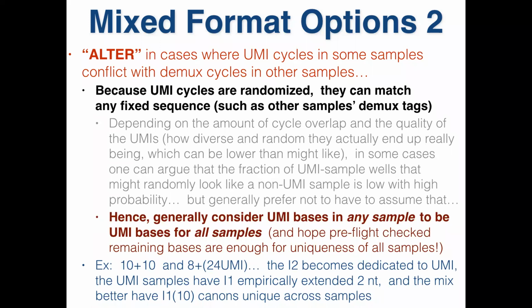And that's what I would recommend. So we upgraded this to 10 plus 24 UMI. This is 10 plus 10. This 24 UMI cycle completely kills this guy. So basically, this becomes a 10 plus 0, or a 10 plus 24 UMI. And this guy's a 10 plus 24 UMI. That's what I call it. So yeah.